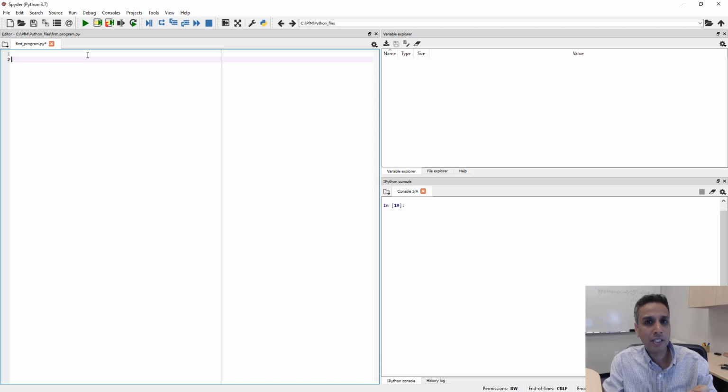And in addition to this, there are other libraries out there. For example, if you would like to load proprietary images, especially from a microscopy point of view, if you are working with CZI images, this is the image format that Zeiss uses. So their microscope images are CZI, and they contain all the metadata that you need to process these images. And that's the reason why they have their proprietary format.